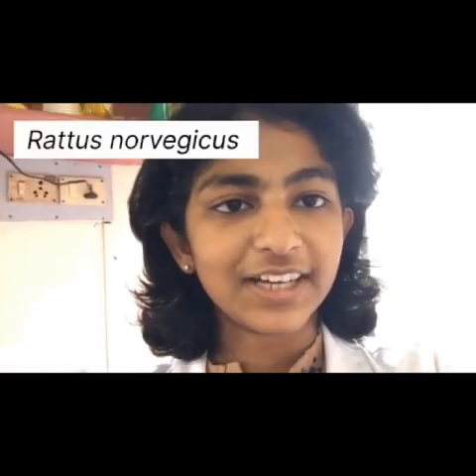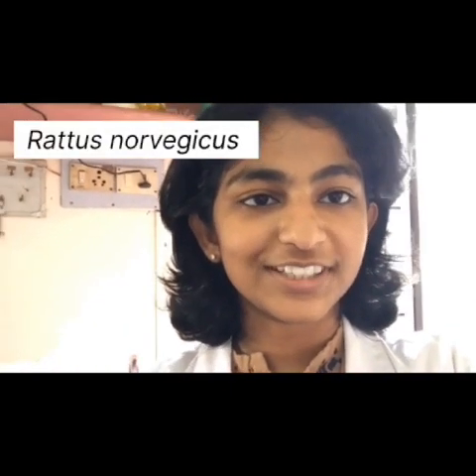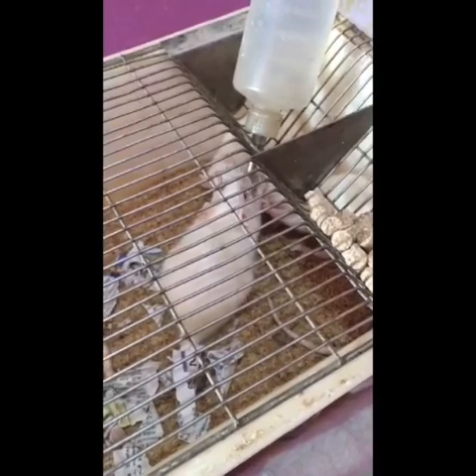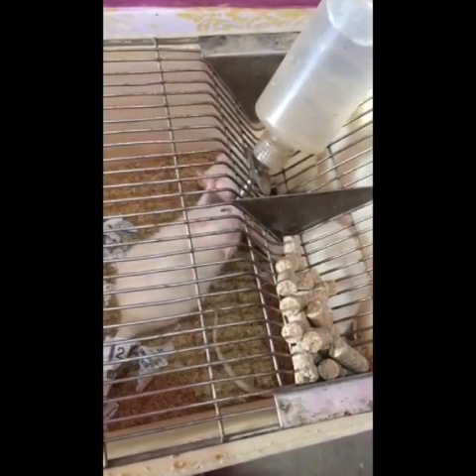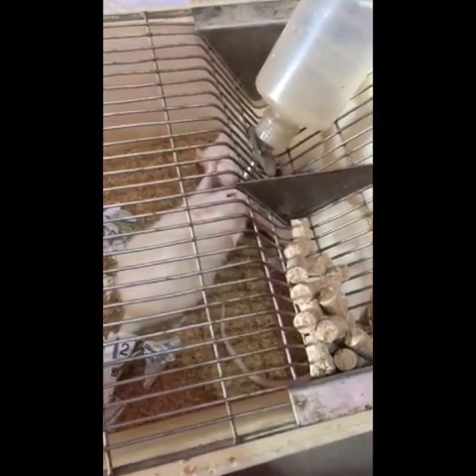We also have Rattus norvegicus, which is nothing but lab rats. These are my lab rat friends. And all three of these are females isolated in a single box because they have just given birth. And these are the little babies.